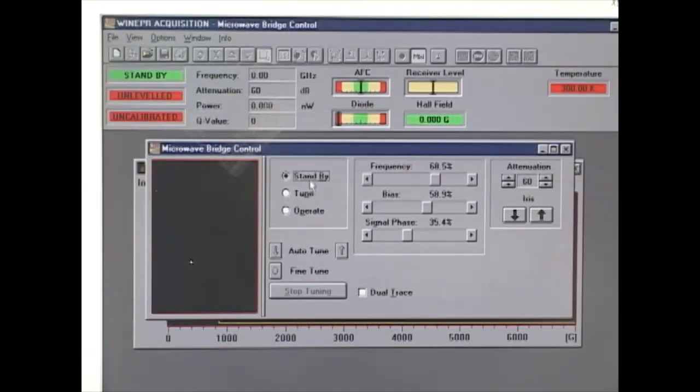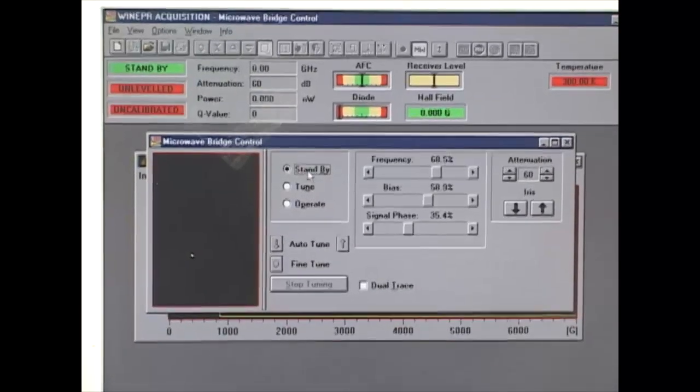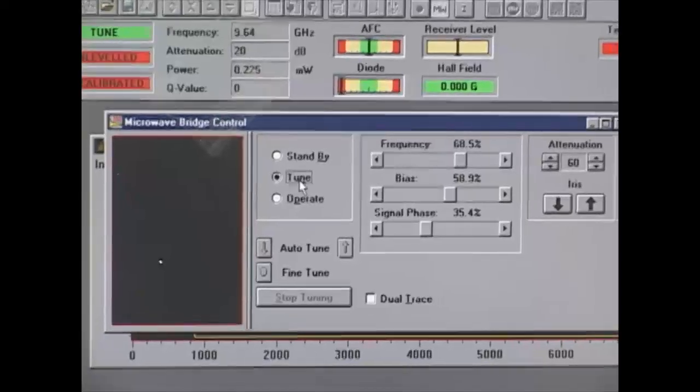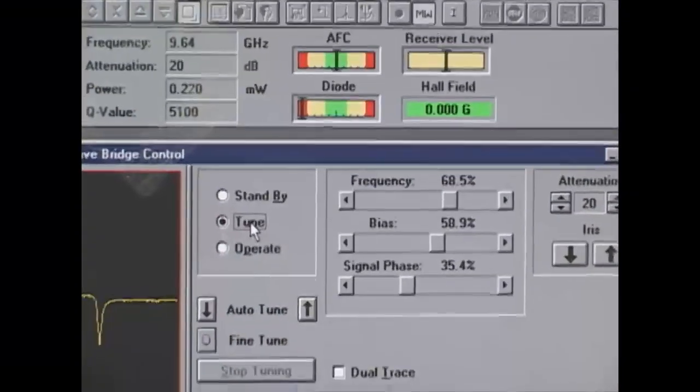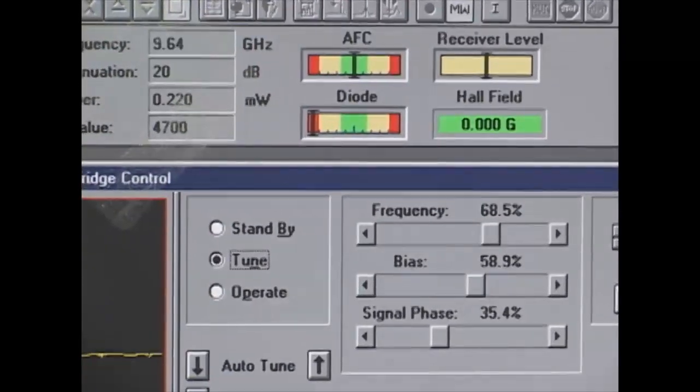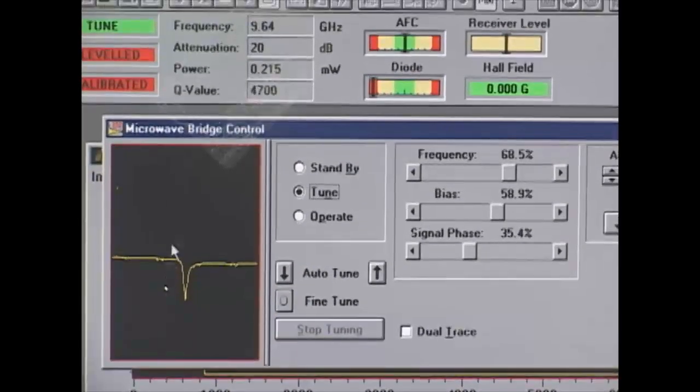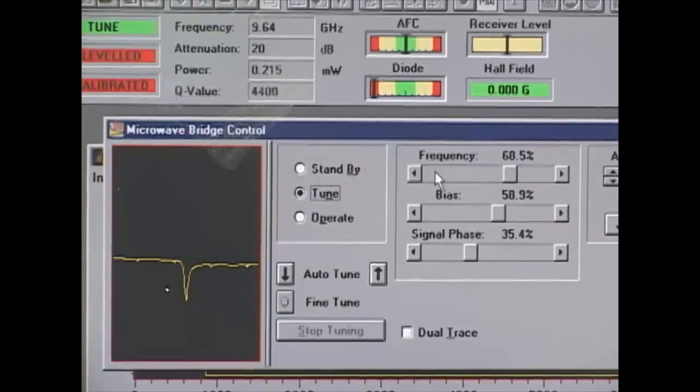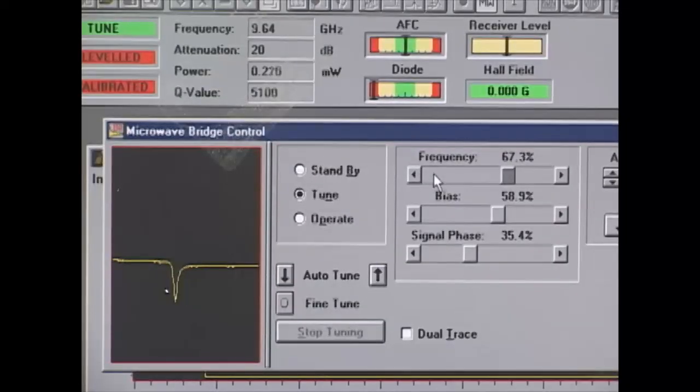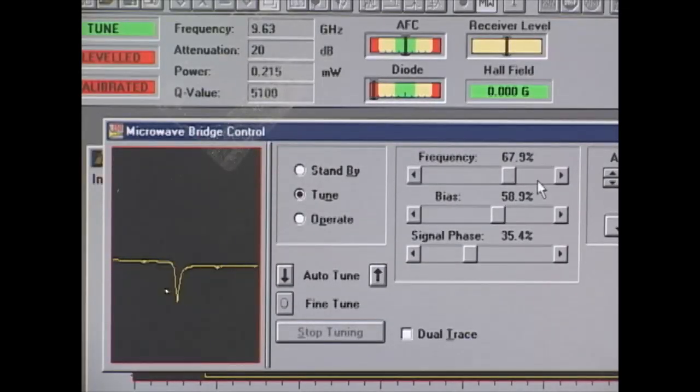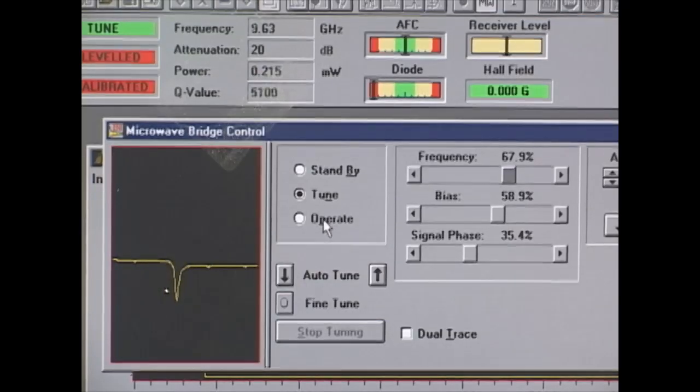From here we can tune our signal. It's in standby, so we go to tune and see our signal in this box. We're trying to get the signal in the center of the box by adjusting the frequency. Once it's in the middle, we go to operate.